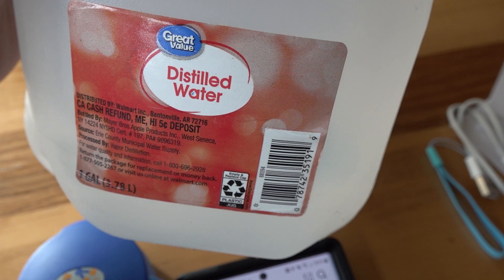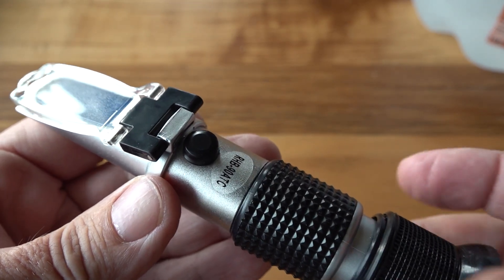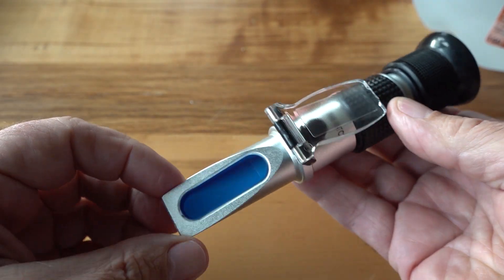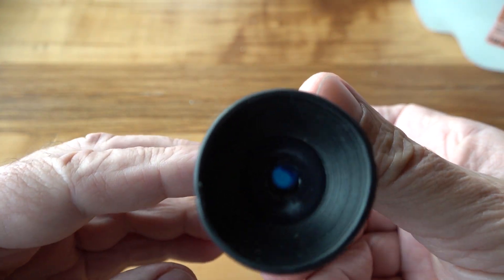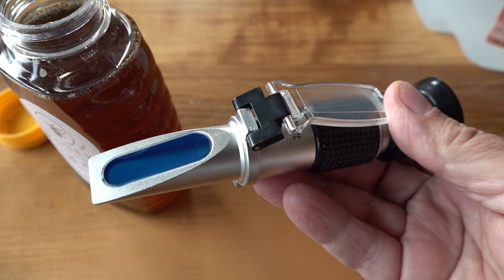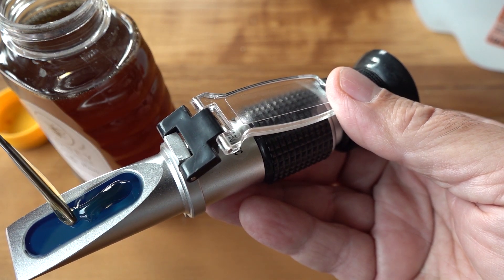Right now it is not looking good for the FJ Dynamics pocket refractometer. We calibrated it with distilled water and now I'm going to test another type — probably the cheapest refractometer you can get. I'll put links to all of these down in the video description. Even though FJ Dynamics gave me their unit, they just gave me a link to their website. The cheap manual refractometer should give a good accurate reading — and we already know the expensive MISCO read 17.5% water.